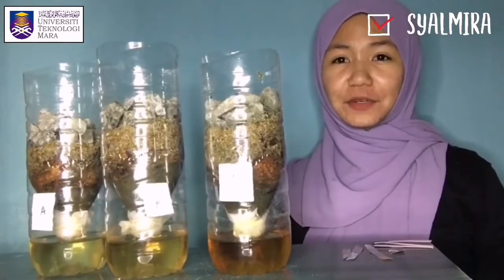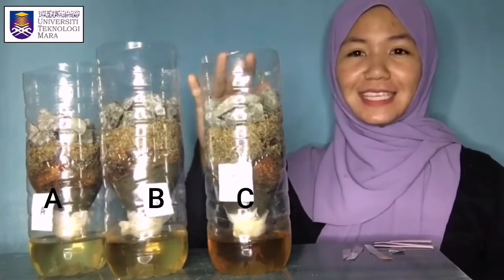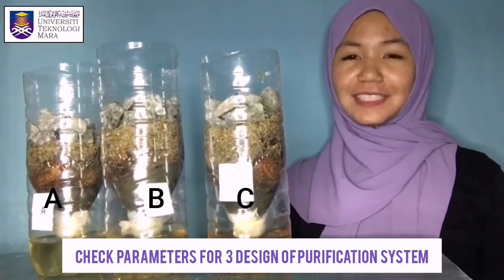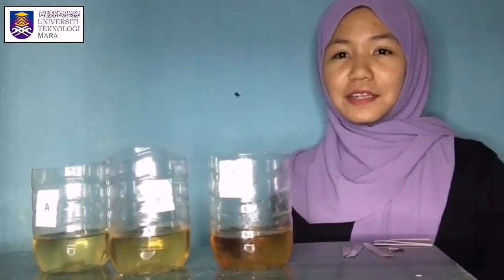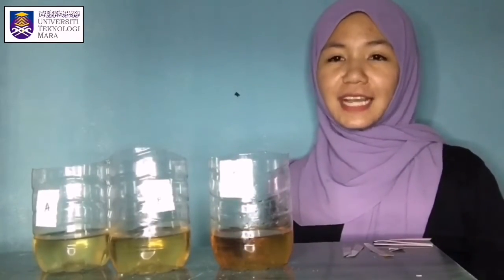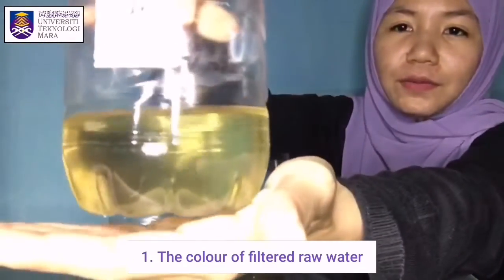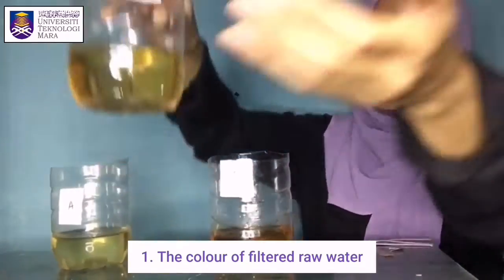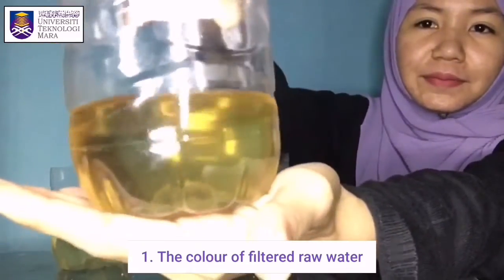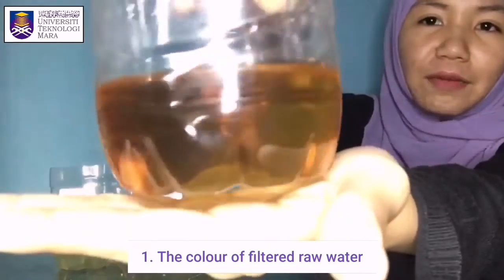There are 3 different water purification systems that label as A, B, and C. Let's check the parameters for this experiment. The first parameter we can observe is the color of the sample. Sample A, light yellow. Sample B, yellow. Sample C, brown.